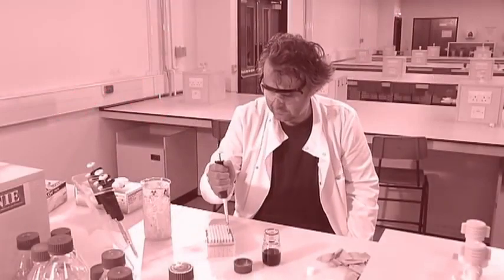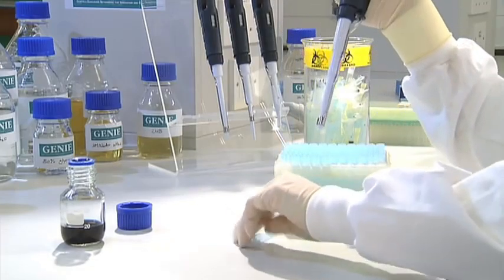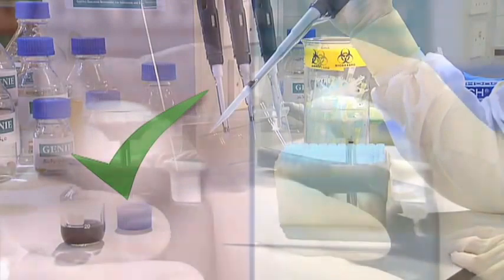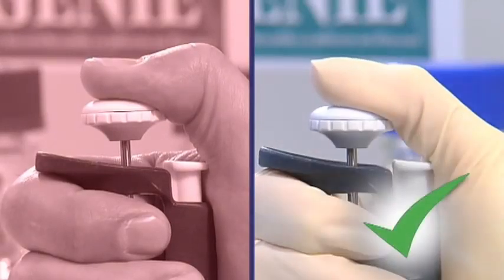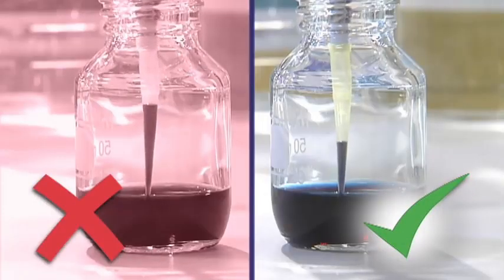If you're having trouble attaching a tip to your pipette, don't repeatedly jam the pipette into a tip. This can damage the pipette. And if the tip doesn't stay on the end of the pipette, simply repeat the procedure with a new tip. When pushing down the push button to take up a set volume of liquid, don't push past the first stop. If you push past the first stop, the volume you then take up will be too large.